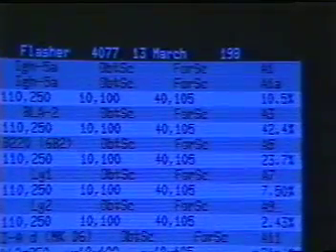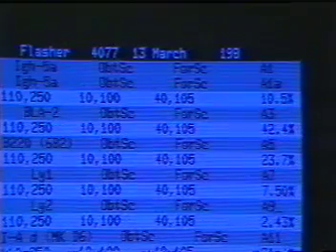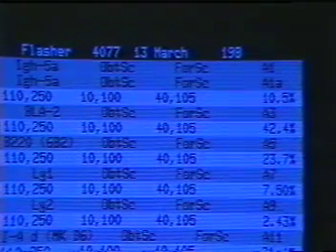The results of the normal priority jobs have now been returned to the desk. The number on the right side of each analysis line indicates the percentage of cells in that sample that satisfied the gating conditions of the analysis.